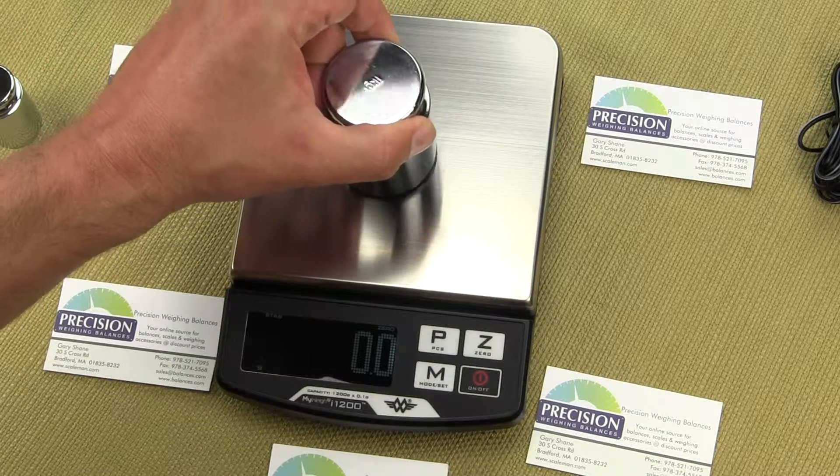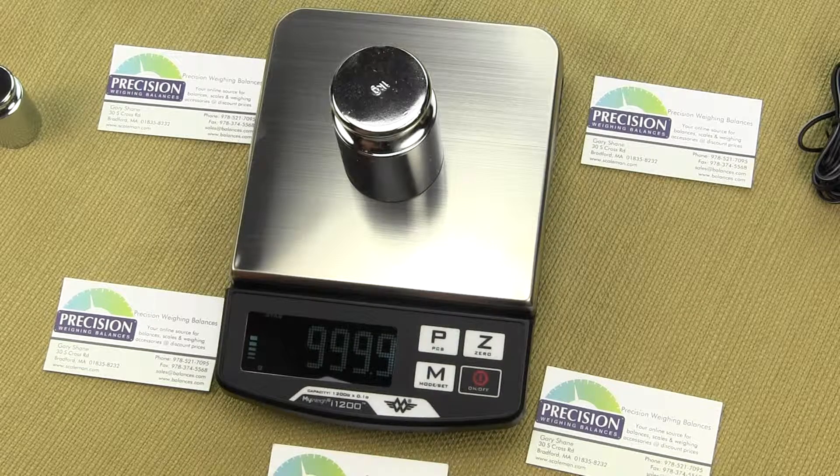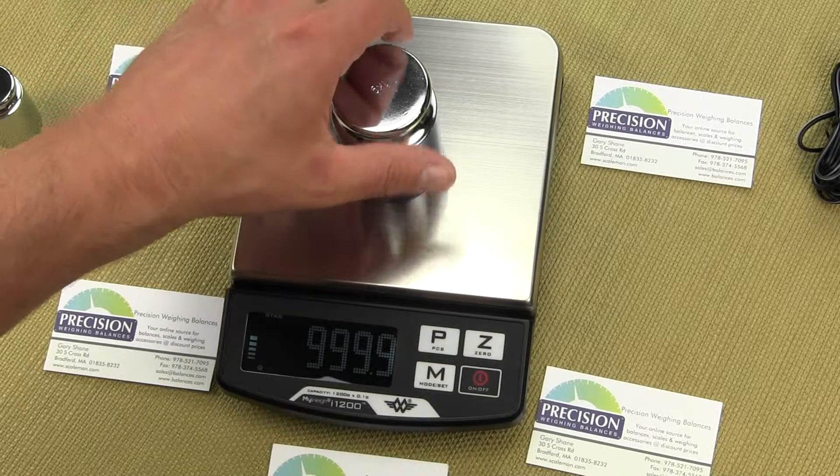We could calibrate the scale again to bring it to exactly 1000, but that's close enough.